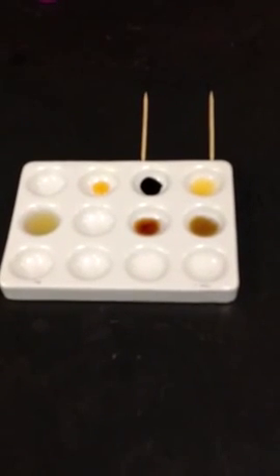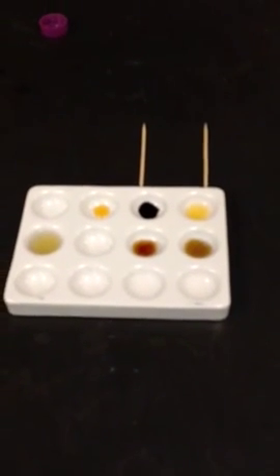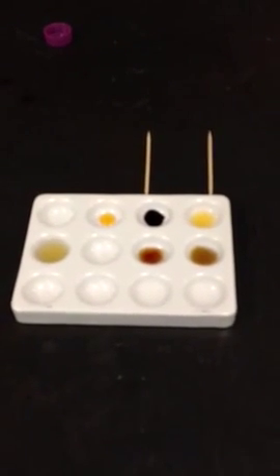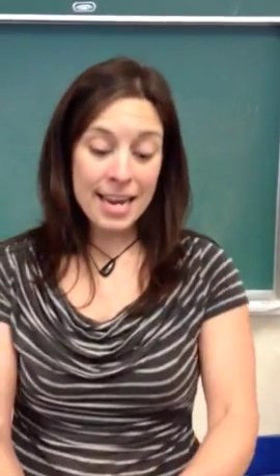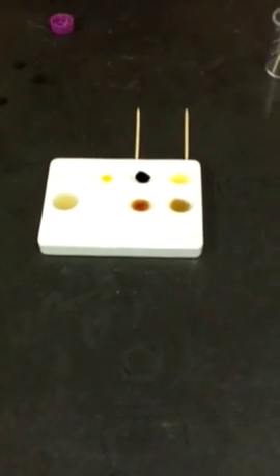That is still in the process of digestion. But we can tell already that that amylase does indeed break down starch, because when we put starch and iodine without any amylase, it turned really, really dark right away. And here, it is not as dark. It's brown. It's not yellow yet, but it's certainly not black. All right, so let's try another drop.